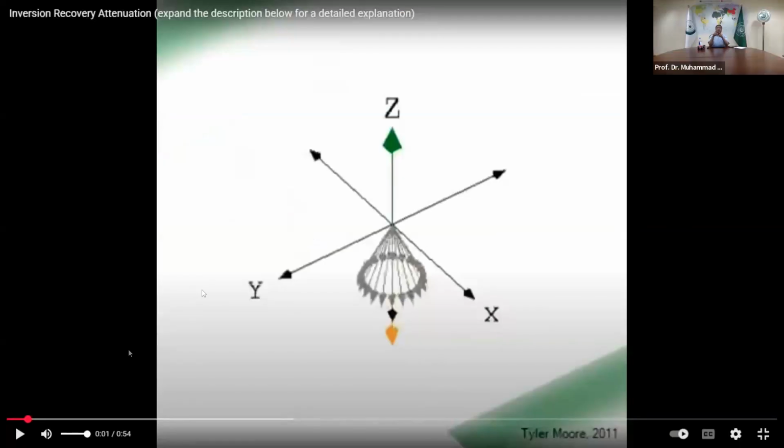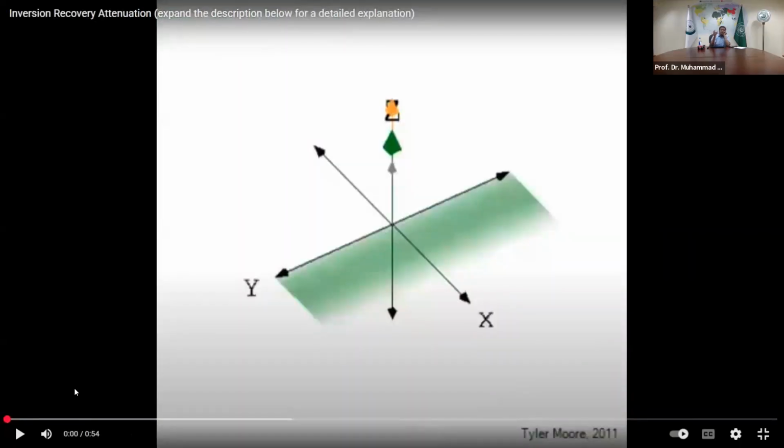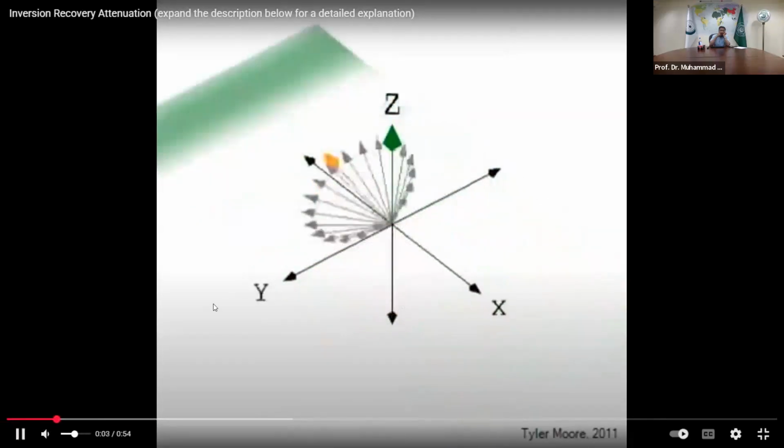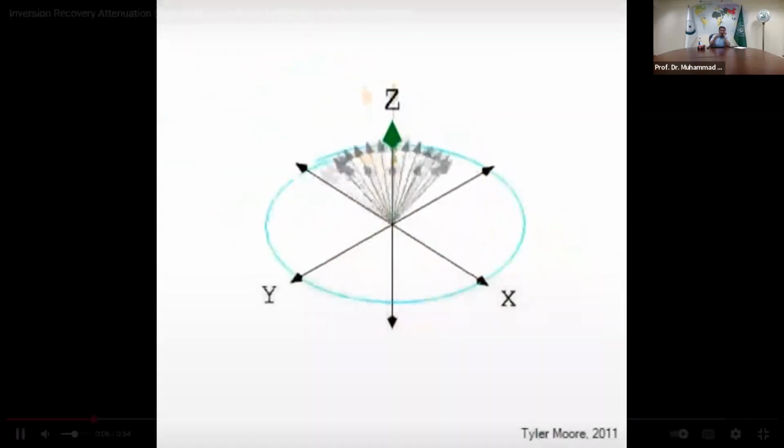Sir, can you see? Okay, so you see the 180 XY pulse brought this magnetization vector down there. And remember that the bulk magnetization vector is just a representation of several vectors of the same direction. Then the 180 pulse brings it from Z to minus Z. Now it has to recover, right?